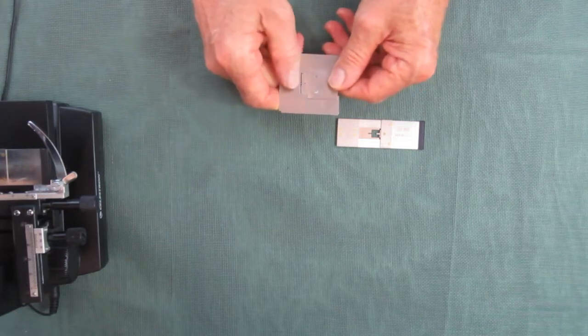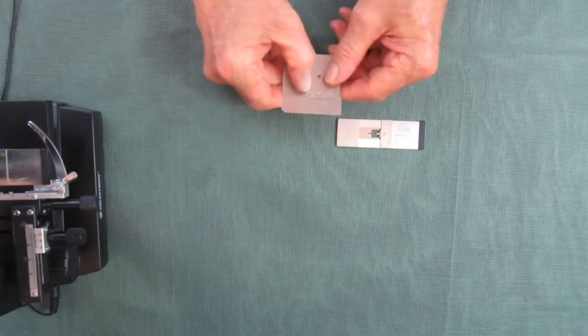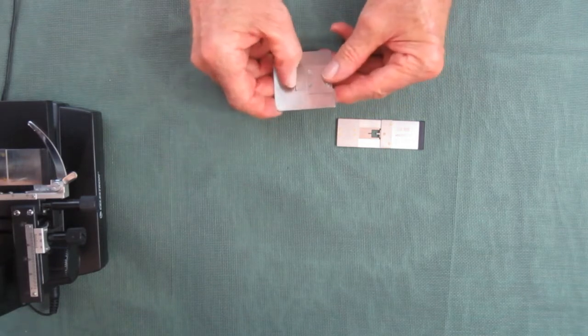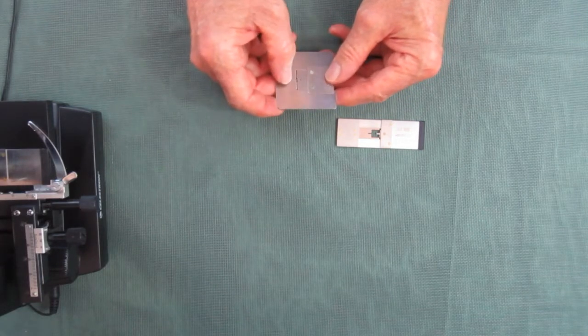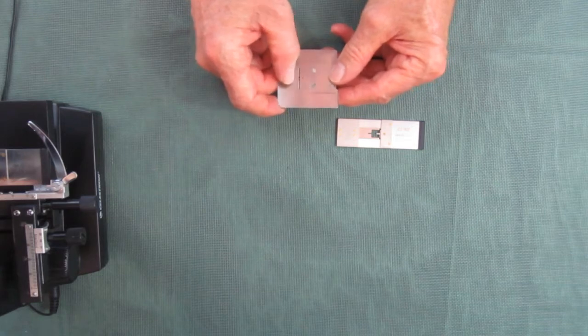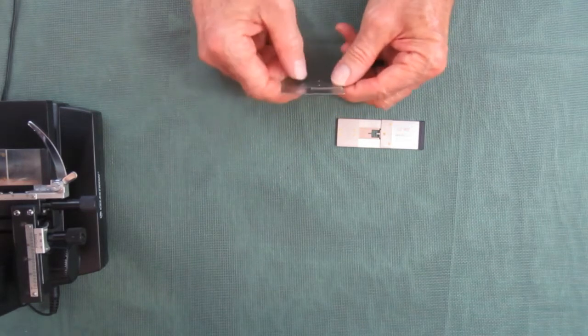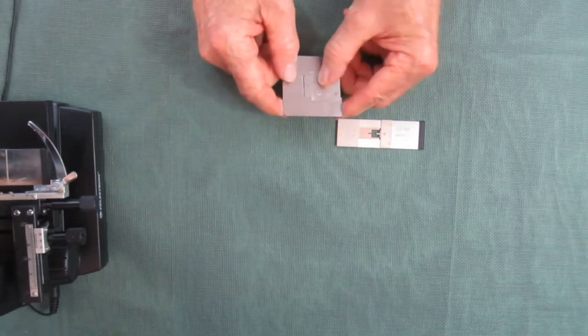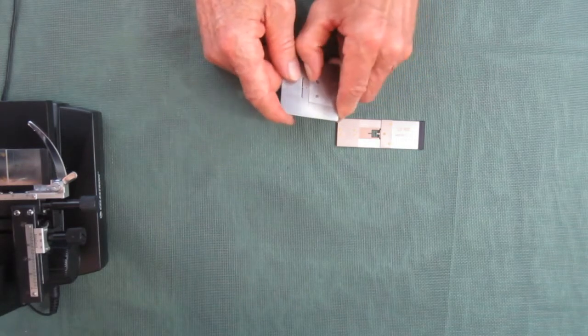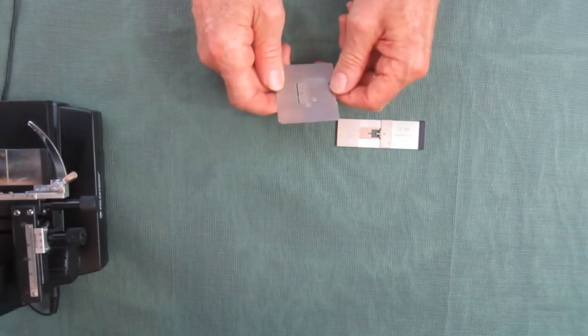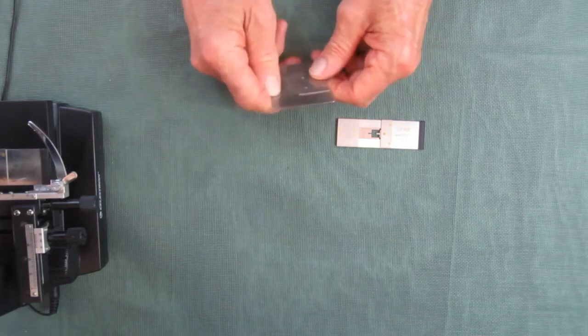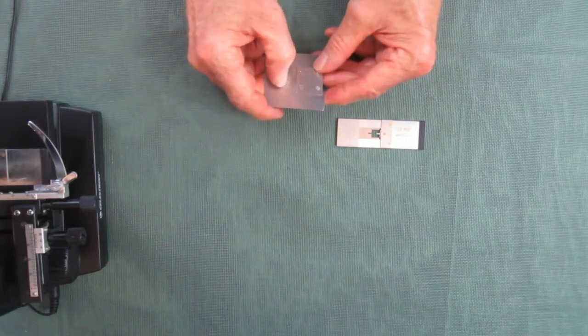They did a fairly good job, but some of them had a bit of misalignment where the tip went into the groove. This one doesn't feel that bad, but one side is better than the other.